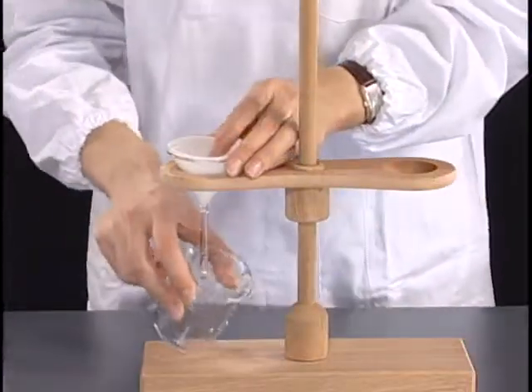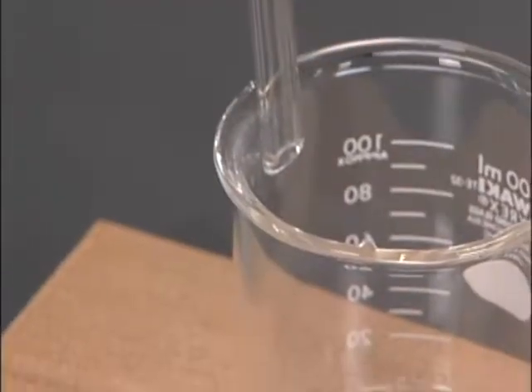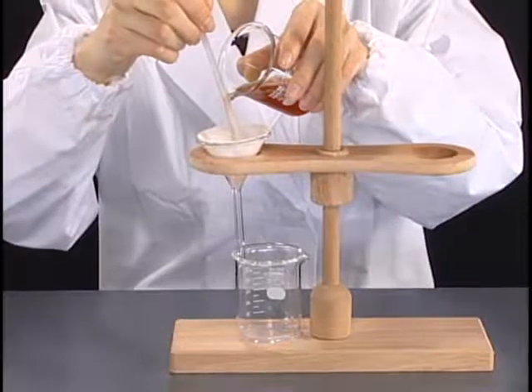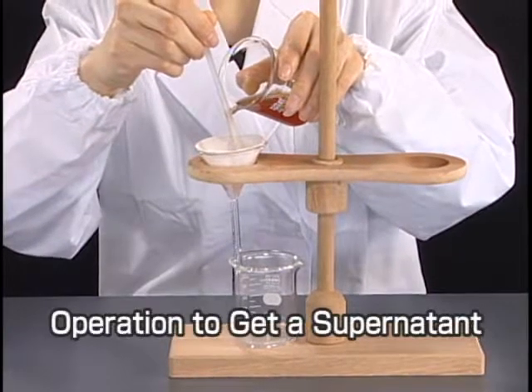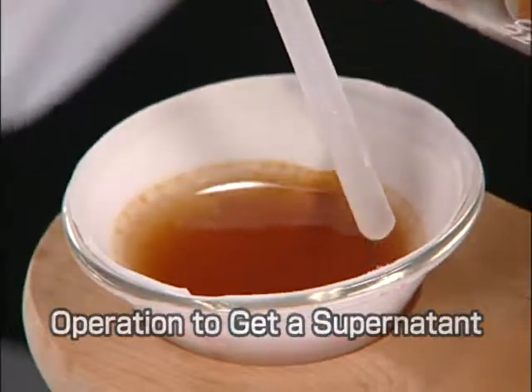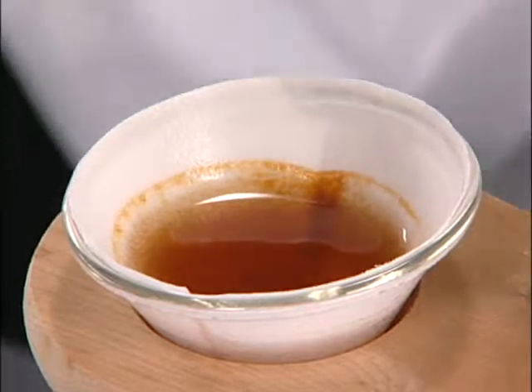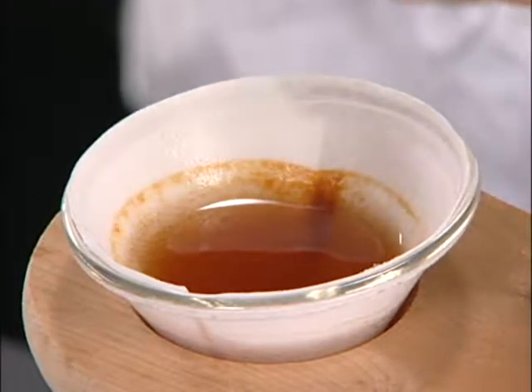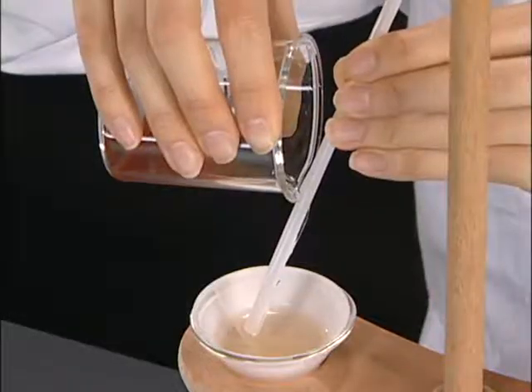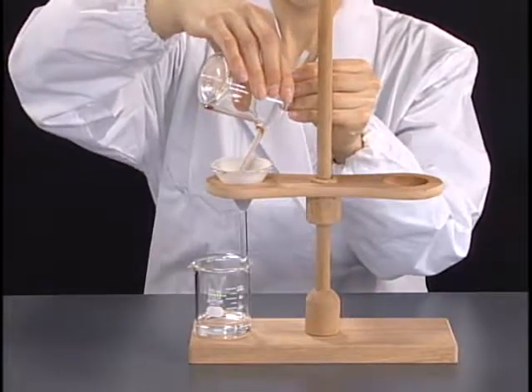Place a beaker in a manner that the stem of the funnel touches its inside wall. Put a stirring stick on the mouth of the container and decant the sample slowly when the filtrate is required. Don't pour an excessive amount of the sample above the edge of the filter paper. The filtration proceeds smoothly when the supernatant and then the mixture containing the precipitate are filtered.